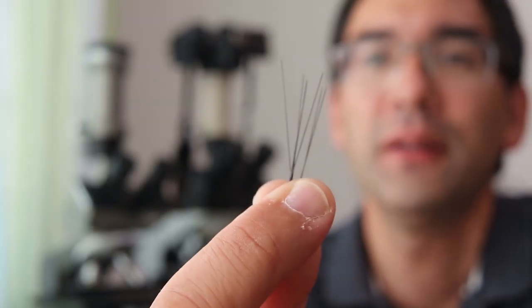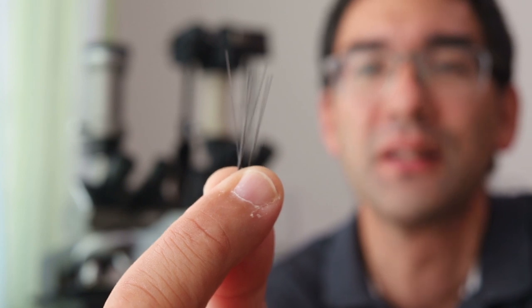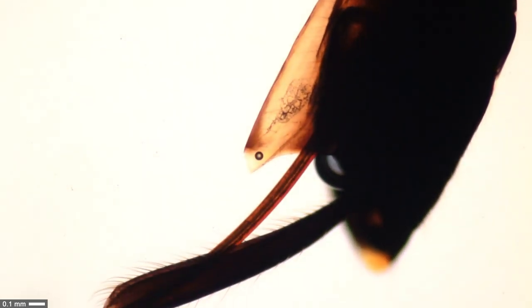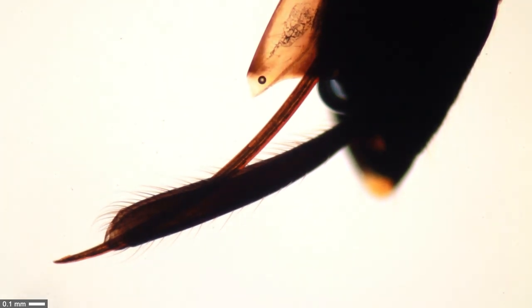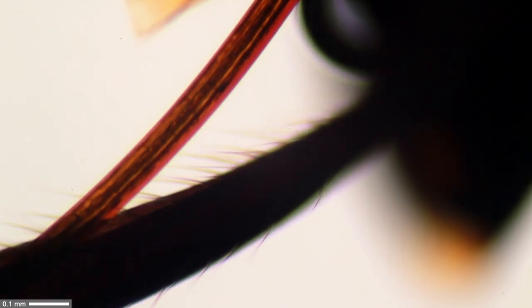This is now part of the abdomen that I also mounted. We can see that the stinger is actually made of two parts. There is the main stinger - the very sharp structure - and it's covered by a larger, darker structure with many little hairs on it. I think that maybe this could be the organ responsible for depositing the eggs. Both of them evidently need to work together for putting eggs into the caterpillar.